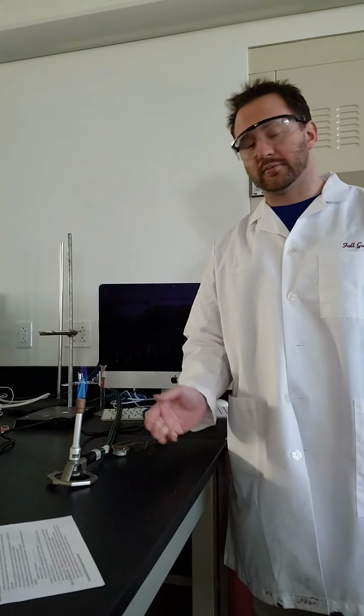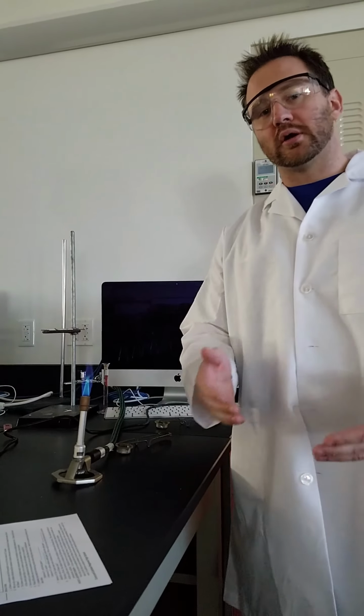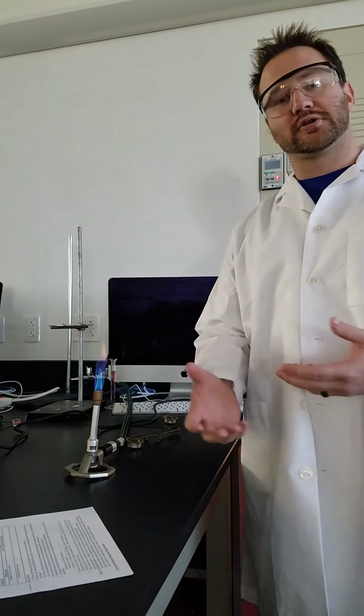In this video, we're going to take a look at the flame test lab, in which we analyze a bunch of samples to see what colors are emitted when they're heated in a Bunsen burner flame. First, we're going to look at a bunch of nitrates, so it's a metal ion or cation with nitrate as the anion, which is common between all of them.